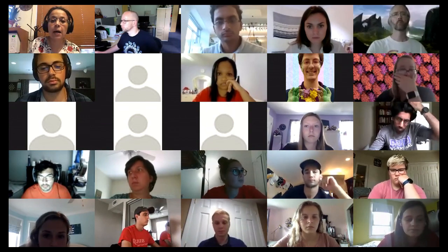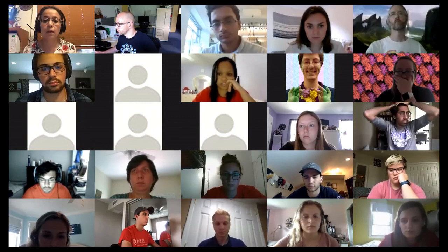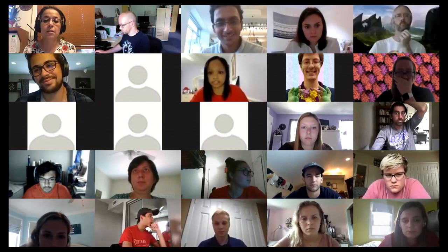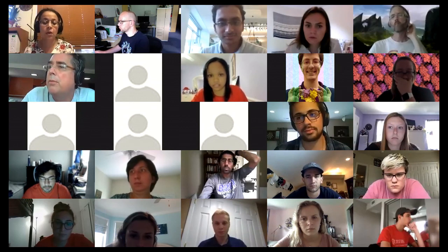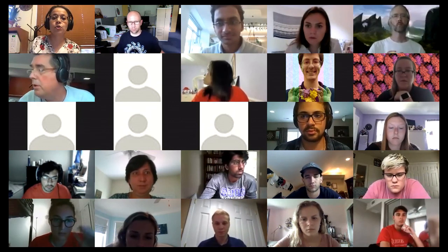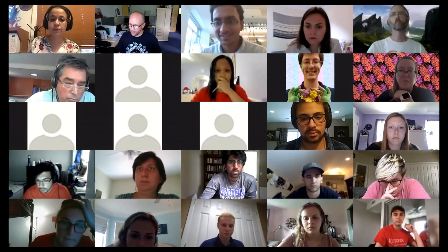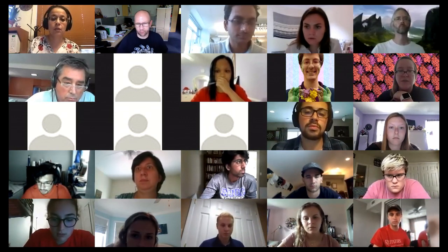So Mike asked, can you show again how you got there? Can you remind me where the there is? So the exercise, please. I'm sorry, I'm not keeping up with your clicks. If you maybe give a second when you click something to keep up, that would help. No problem, Mike. I also put it in the chat. It's just the left menu, click on Mol* visualization. And then the exercise is the second link.